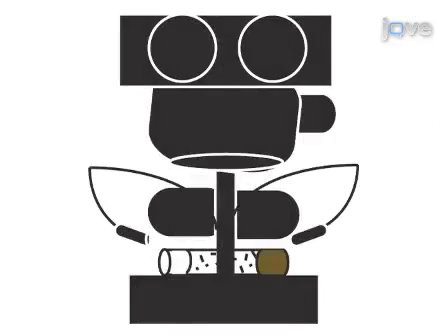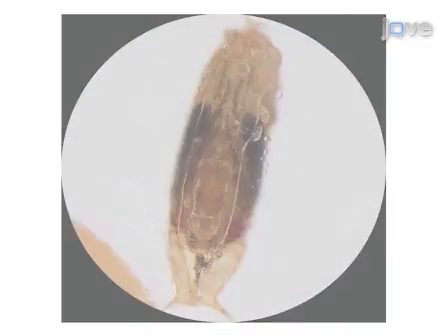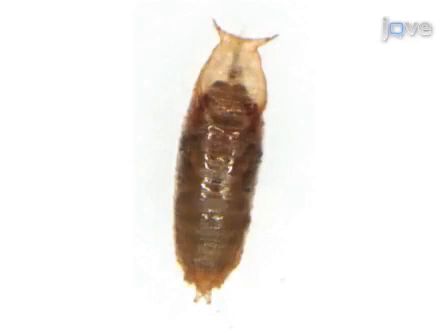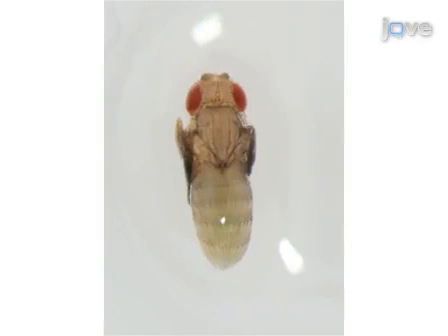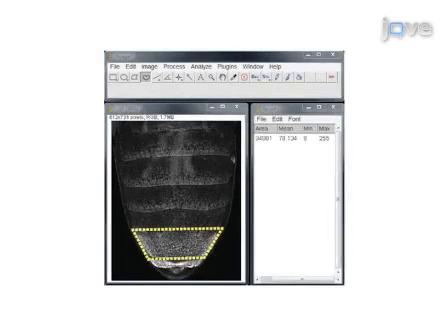Using a stereo microscope, obtain transgenic specimens of the correct developmental stage. Remove specimens from the outer puparium and mount them on a glass microscope slide. Proceed to record the level and pattern of fluorescent reporter protein expression in whole mount samples by confocal microscopic analysis. Finally, quantify the level of fluorescent reporter protein expression for recorded confocal images using the ImageJ software tool.